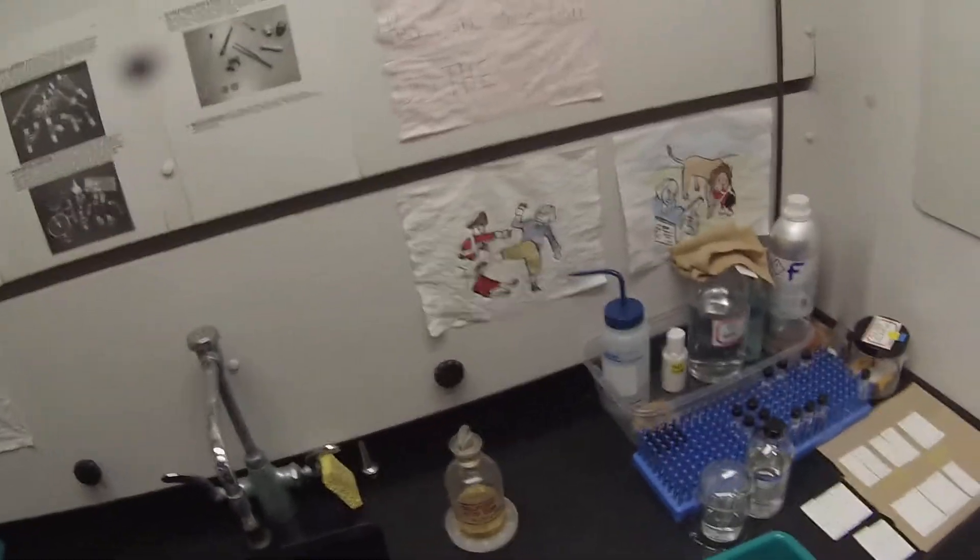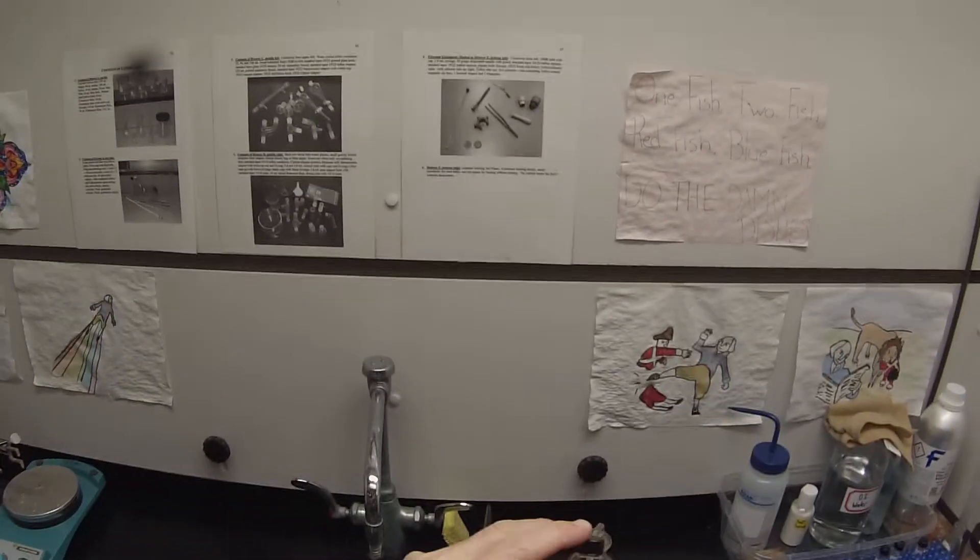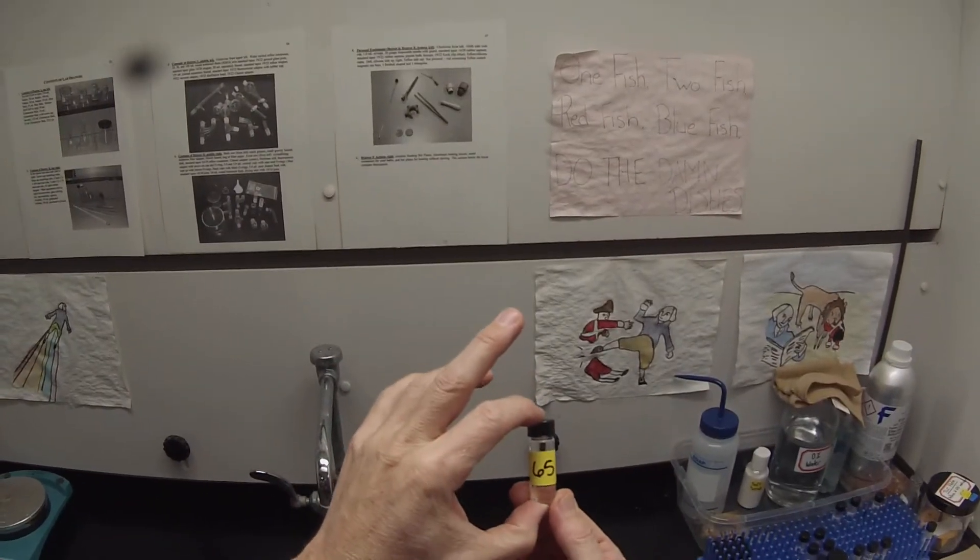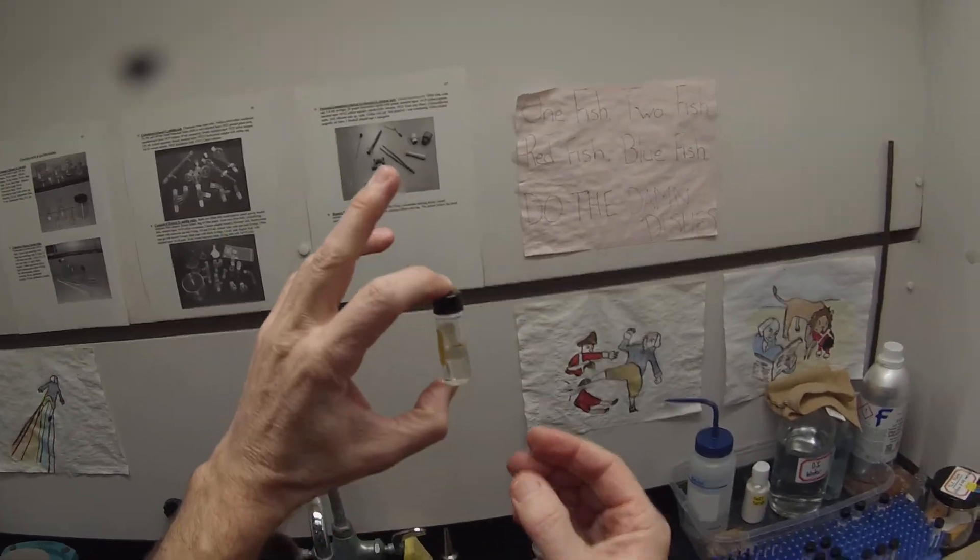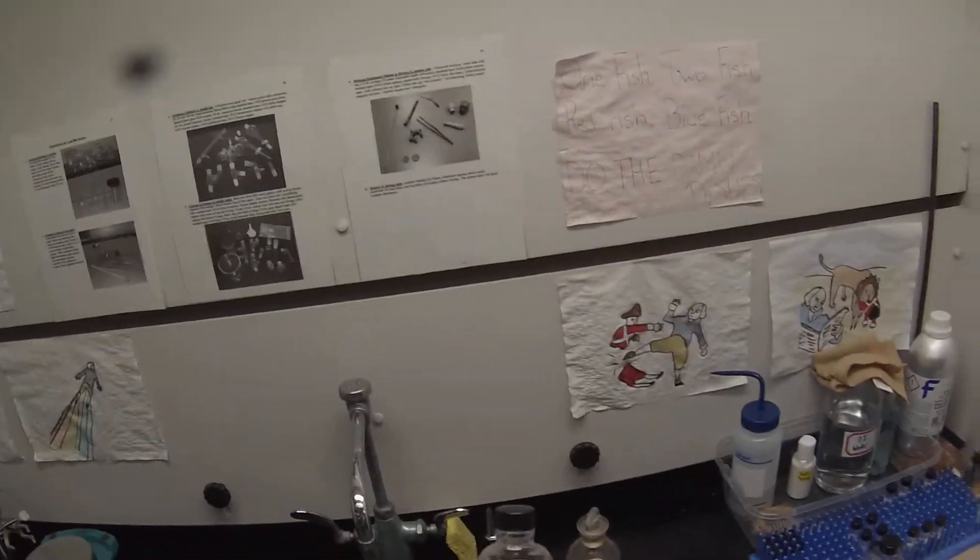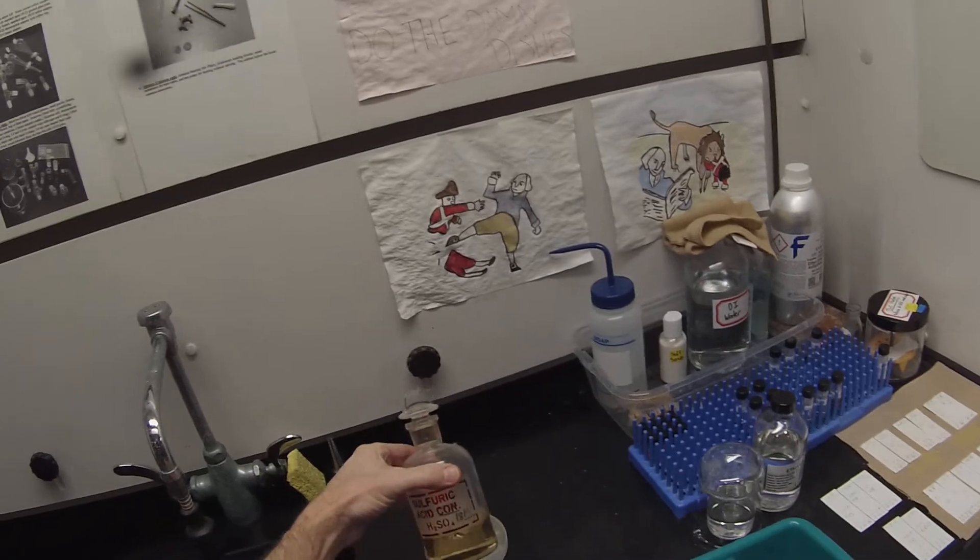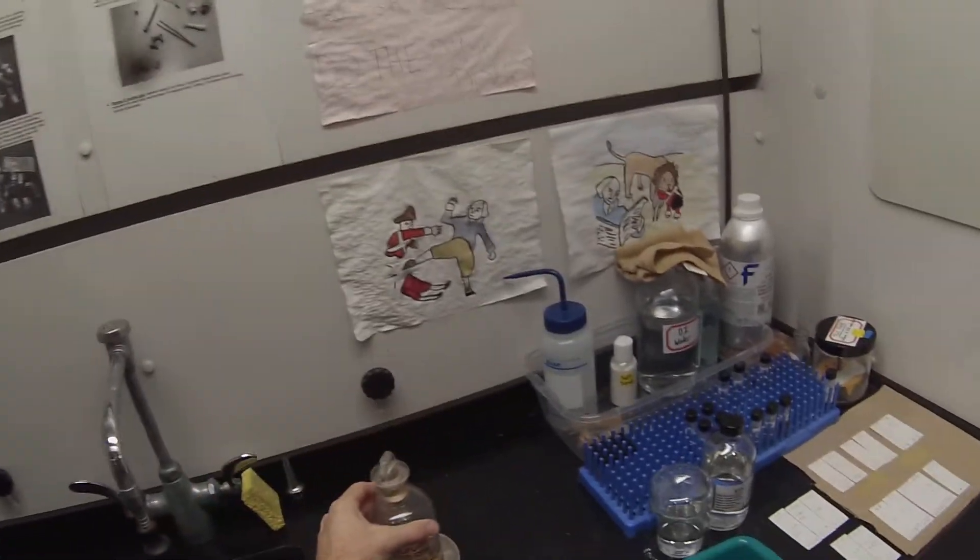So today we're going to be setting up the acetylation of an unknown alcohol lab. We have our unknown alcohol number 65 here, probably about 2 milliliters, and some glacial acetic acid, and a bottle of concentrated 18 molar sulfuric acid.